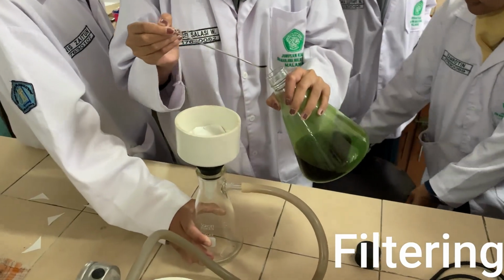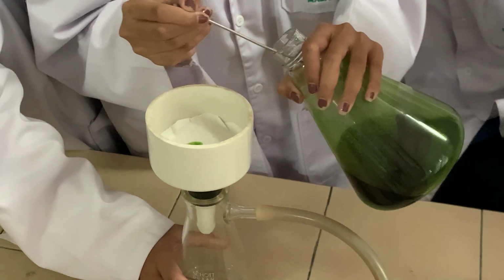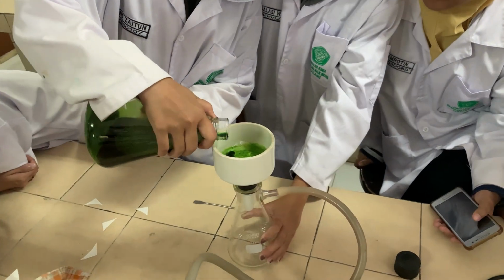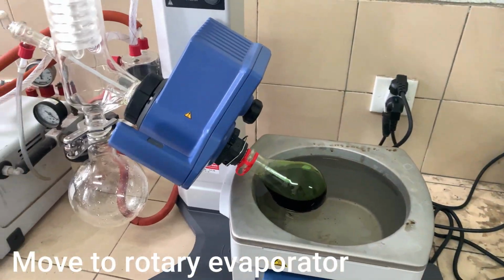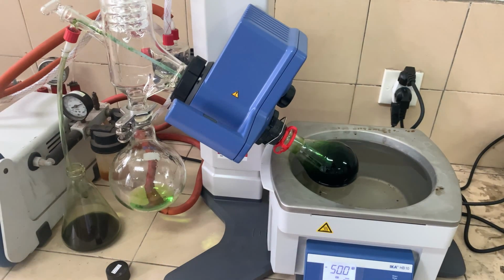For the maceration of alkaloid isolation from papaya leaves, a ratio of 1:5 leaf powder and ethanol was used, then shaken for 24 hours. Soaking is repeated up to 3 times with a shaker at a speed of 120 rpm. Each repetition, before soaking, it is first filtered using a Buchner funnel given filter paper to separate the filtrate and residue, then given a new solvent. So we get 3 filtrates for a 50 gram sample.